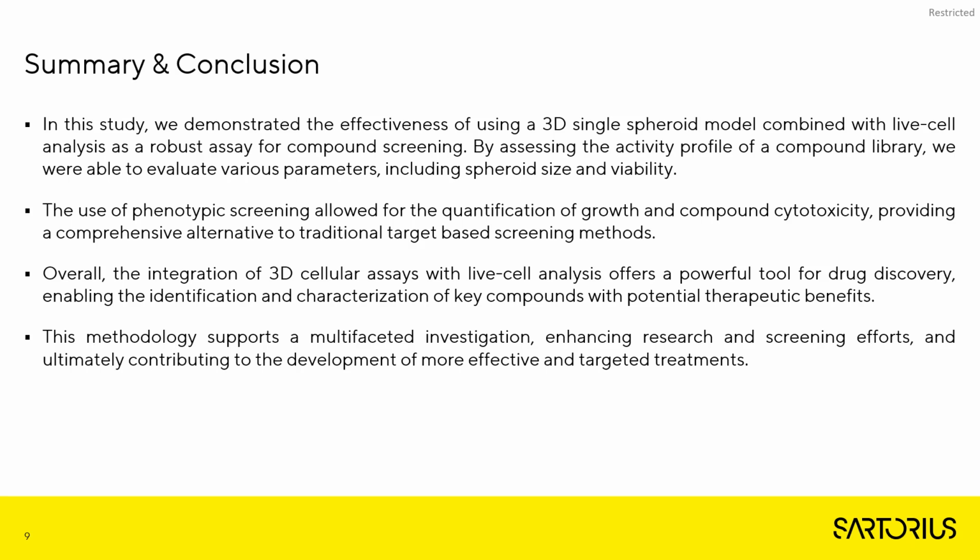Overall, the integration of 3D cellular assays with live cell analysis offers a powerful tool for drug discovery, enabling the identification and characterization of key compounds with potential therapeutic benefits. This methodology supports a multifaceted investigation, enhancing research and screening efforts, and ultimately contributing to the development of more effective and targeted treatments.